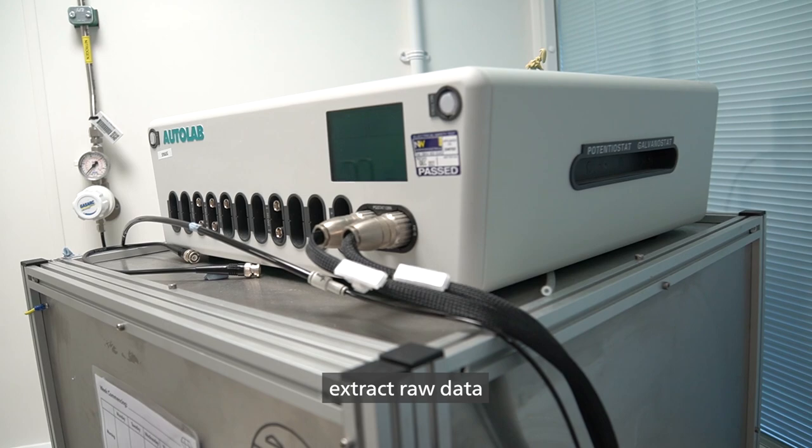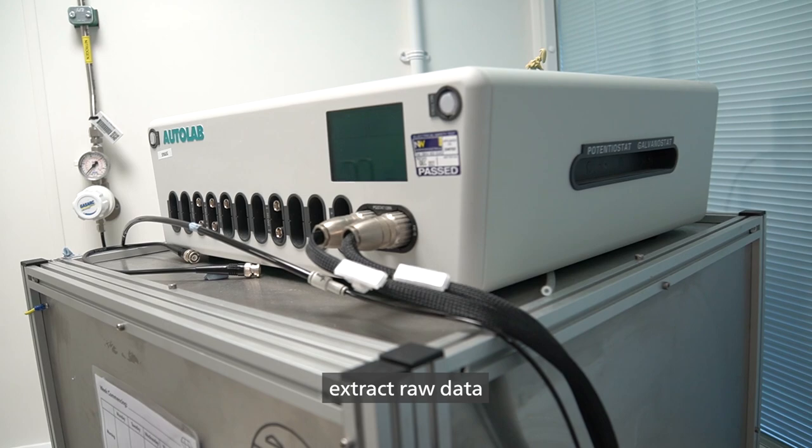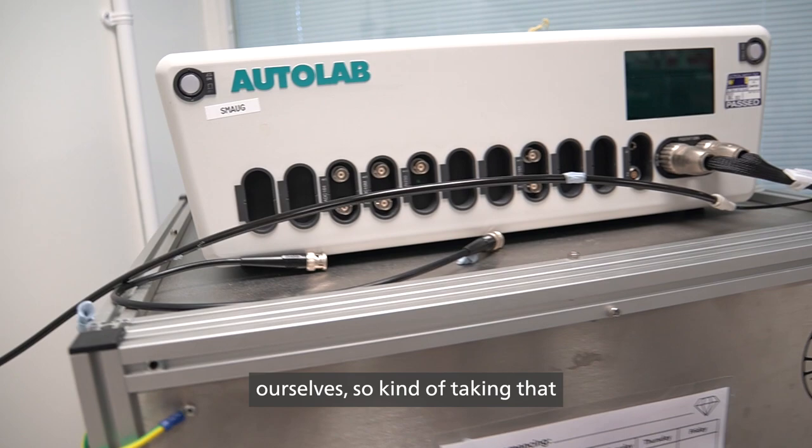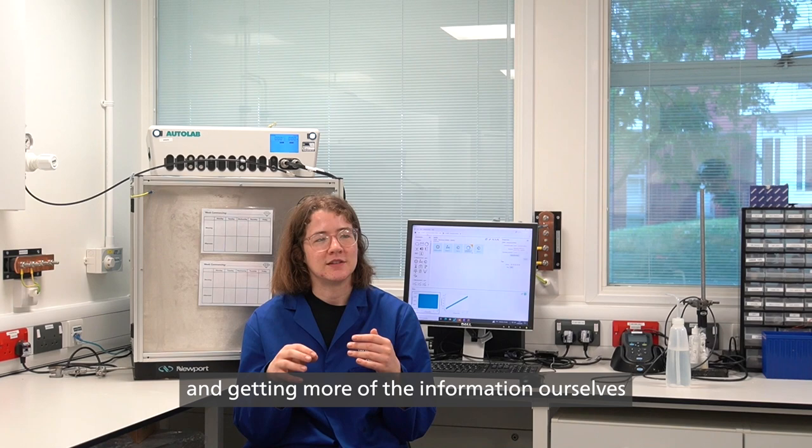We work with Autolab so that we can actually extract all kinds of raw data that we're acquiring in normal square wave voltammetry and then process that ourselves. So we're kind of taking that unknown element out of the equation and getting more of the information ourselves.